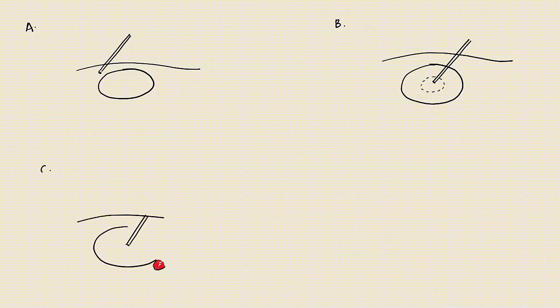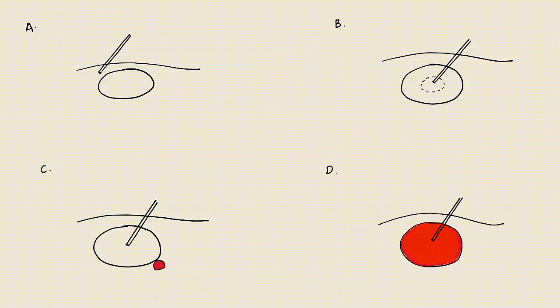Sometimes the needle could have missed the target tangentially, or the needle is in the central cystic or necrotic or hemorrhagic area devoid of the diagnostic cells. Sometimes the needle is in a dominant benign mass missing a small adjacent malignant lesion, or a fibrotic desmoplastic target tissue gives a scanty cell yield.